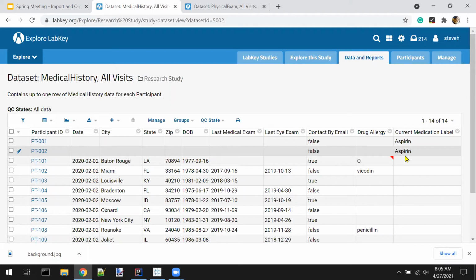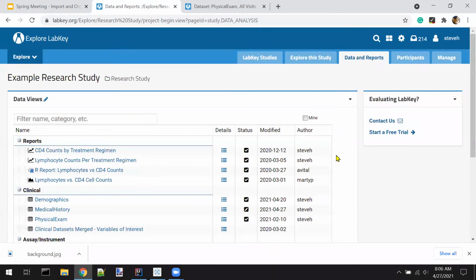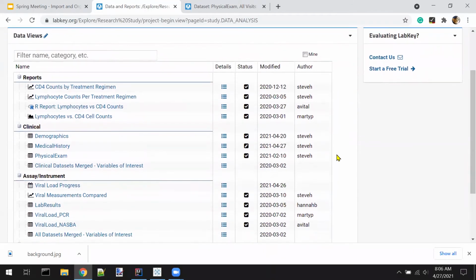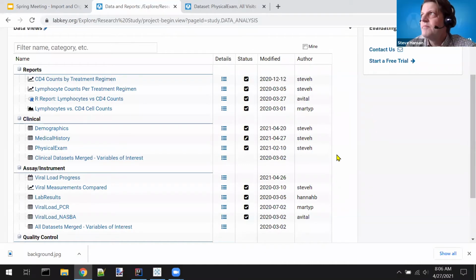One question I'll paraphrase is about assay data coming from an instrument. How exactly does that get in? Do I put assay data into a data set? How does that all work, so that I can take advantage of the joining of columns and so on, like you showed?